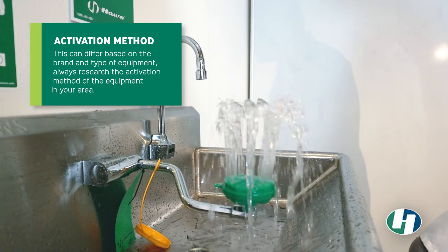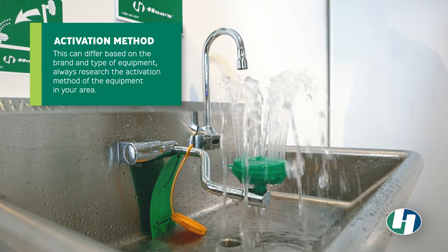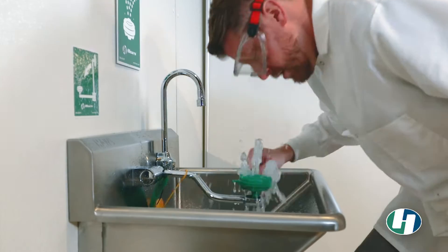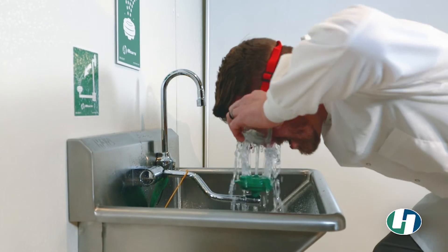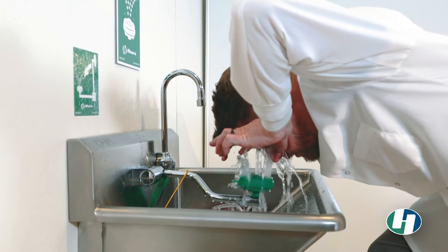Once you've reached the eye face wash, turn it on by utilizing the manufacturer's method for activation. The eye face wash should activate immediately. Rinse your face and the goggles off in the water before removing them. Once removed, rinse the affected area.